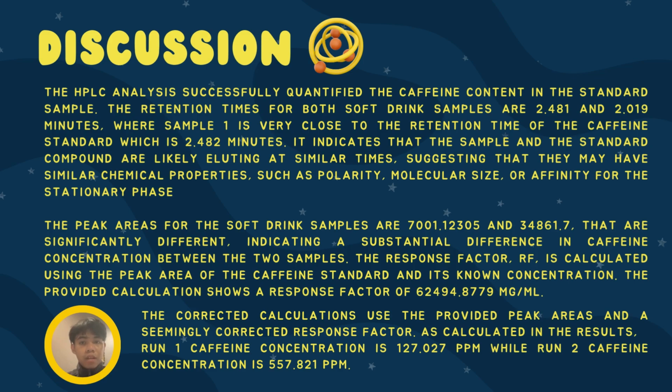The calculation shows a response factor of 62,494.8779 mg/ml.